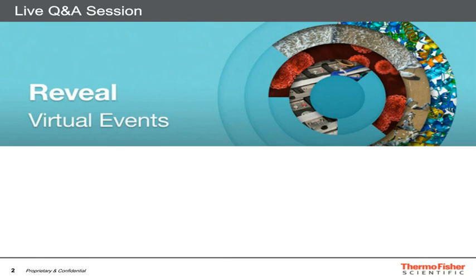Clear. I have another question. It's about depth profiling. So the question is, can the ion etching affect the results of VB spectra during the depth profiling? Okay, thanks for the question. So VB is going to be valence band spectra. So that's looking at the part of the XPS spectrum where we can pick up electronic information.